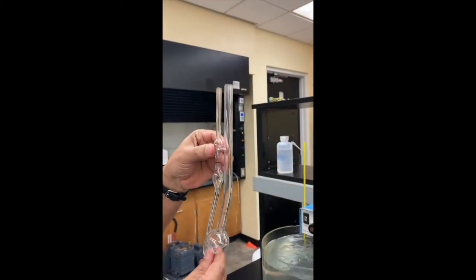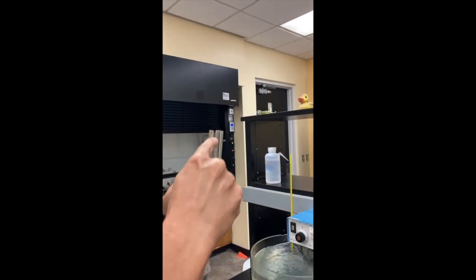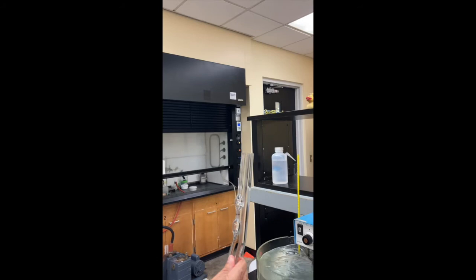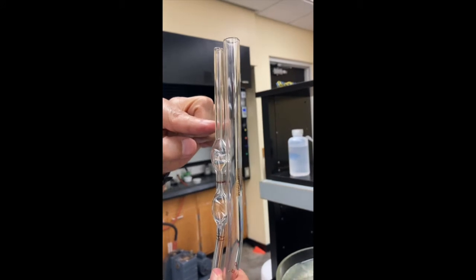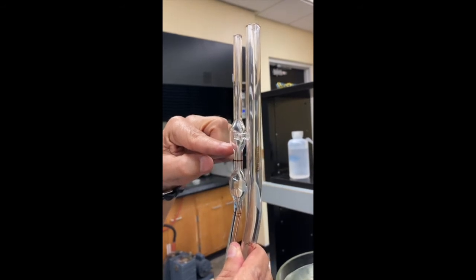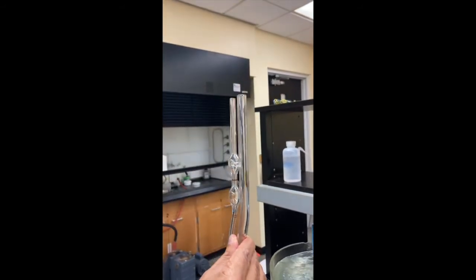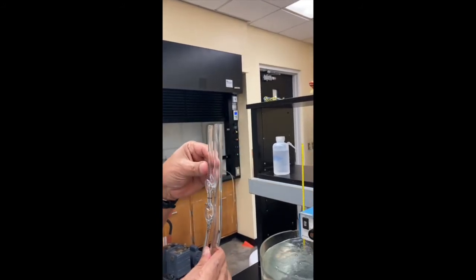So, how are measurements done? 10 milliliters of water or your solution of polymer is poured in this tube, and then a rubber bulb is used to suction this liquid above the upper fiducial mark. And then this bulb is released and the liquid starts to flow down. We measure the time it takes for the liquid to flow from the upper fiducial mark to the lower fiducial mark. And the longer the time, the higher the viscosity; the shorter the time, the lower the viscosity. And that's how measurements are done.